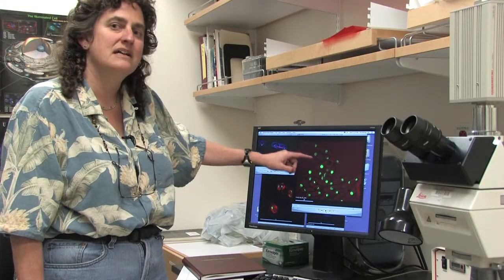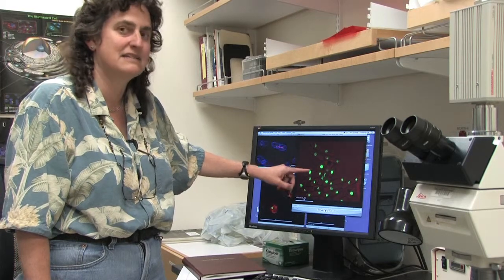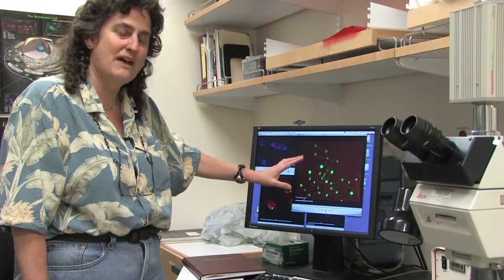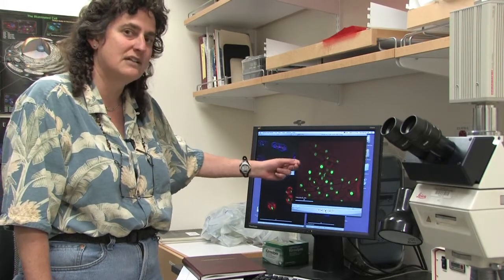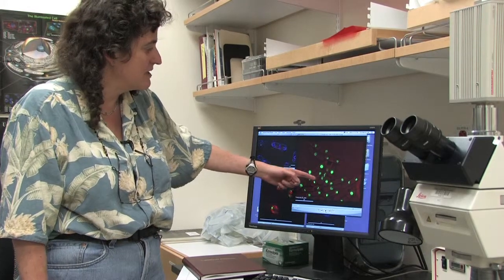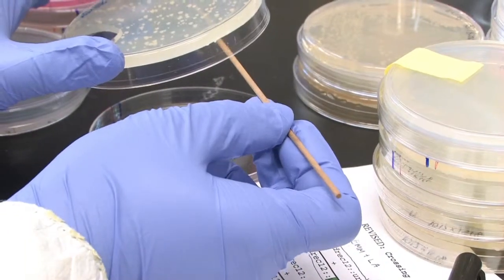These cells are all mutant. They're missing a particular protein involved in chromosome structure. What's interesting is that loss of this same gene in humans is associated with metastasis in breast cancer. So even though we have an organism here that doesn't get cancer, we can study the function of a cancer-associated gene in this organism by looking at this sort of phenotyping.